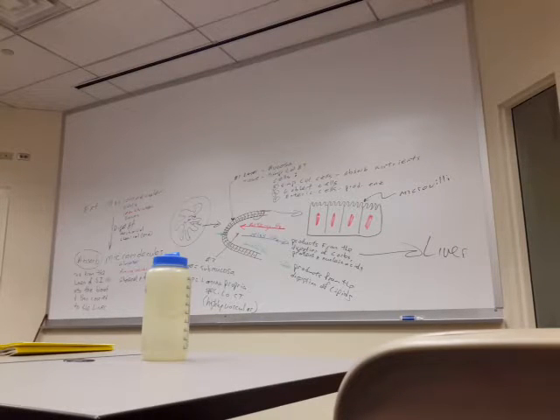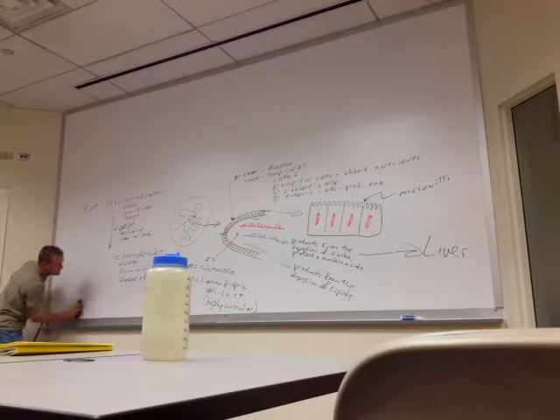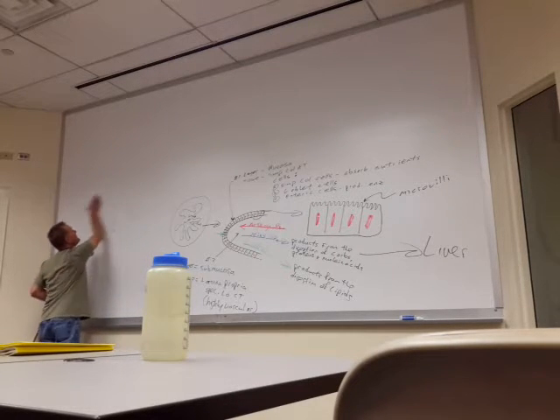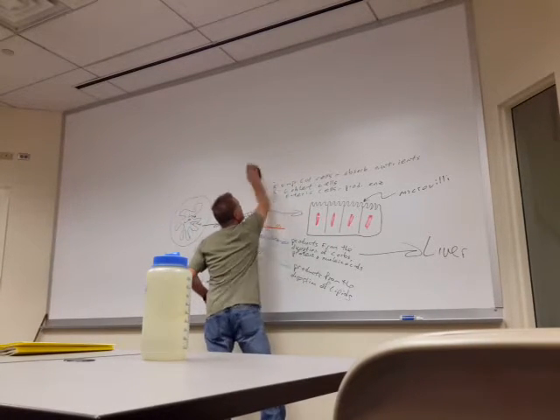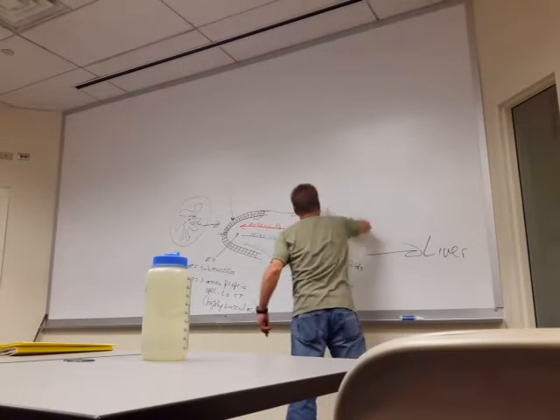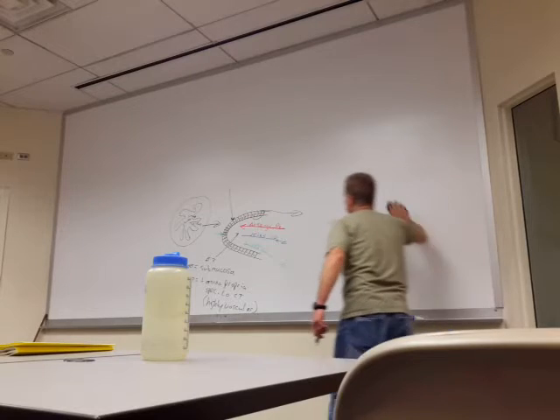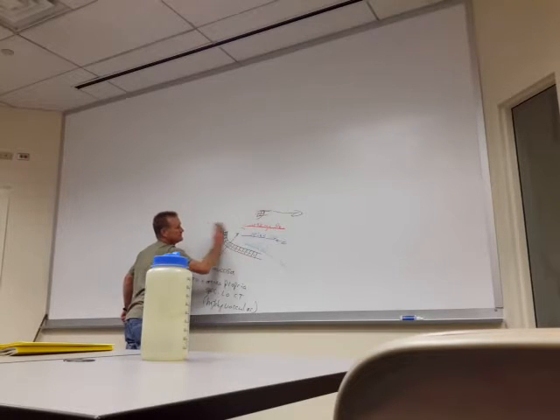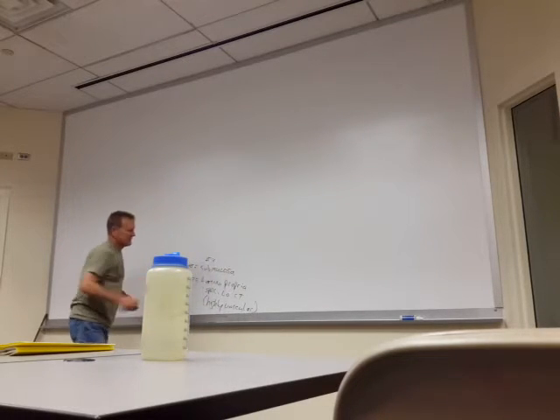So that's simple columnar. I'm sure everybody's got that.